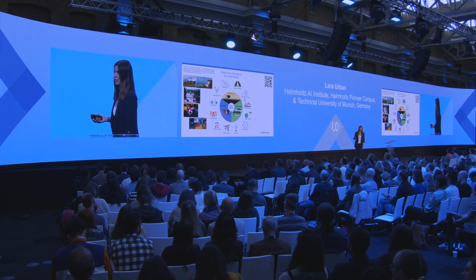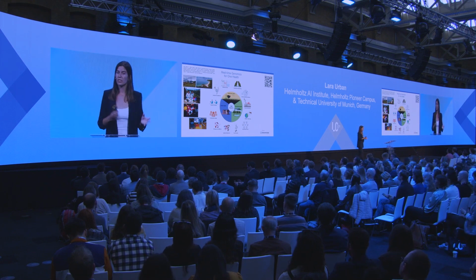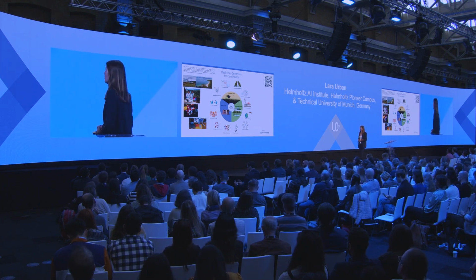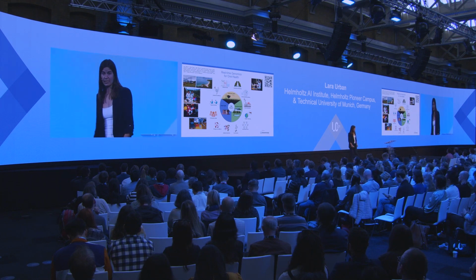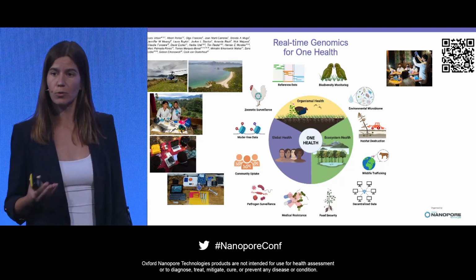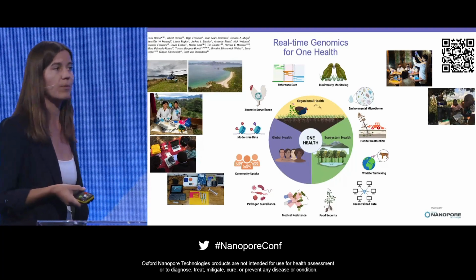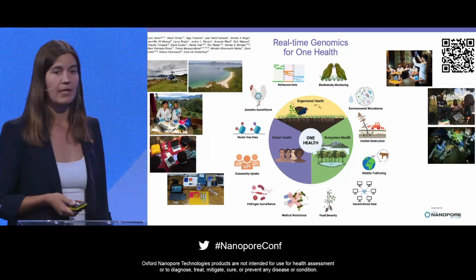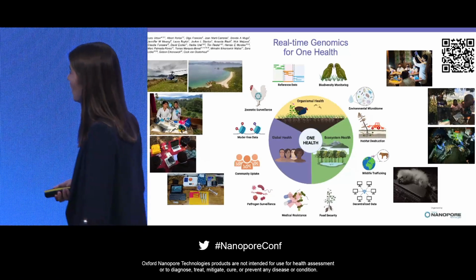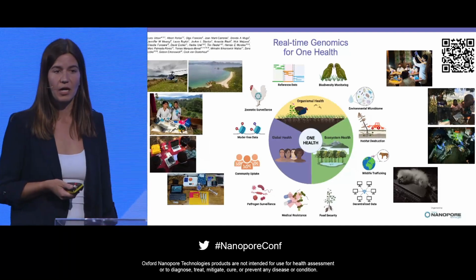And all of this, the real-time application, is obviously only possible if we also develop the laboratory and the computational parts to be able to bring nanopore sequencing into the field. And if we do it the right way, I think there is huge potential to contribute to education, both at schools, universities, and research institutes, and to really include stakeholders, such as the farmers I just mentioned, as well as conservationists. And here I just quickly want to relate to my plenary talk from last year that is still available online, where we used nanopore sequencing to monitor the health of the critically endangered kakapo species in New Zealand.